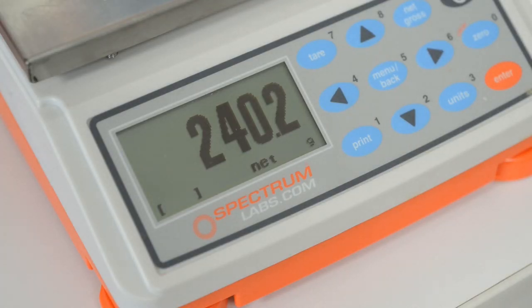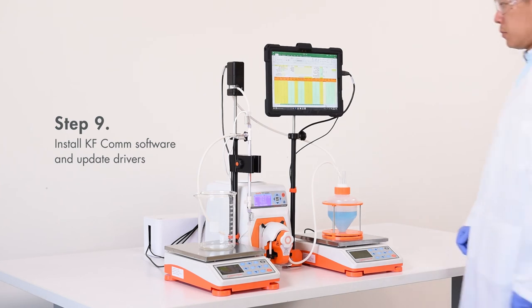Install KFCOM software and update drivers.